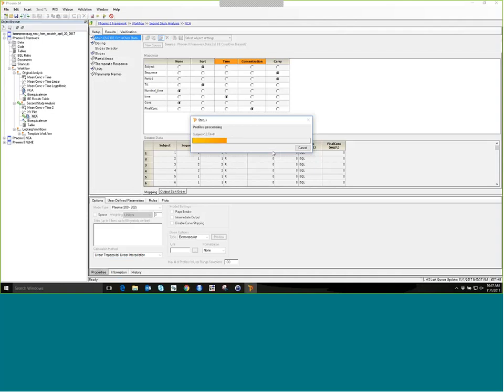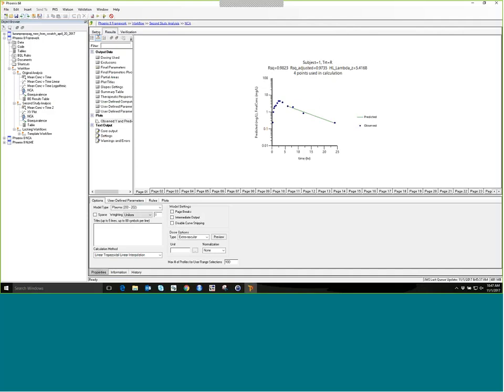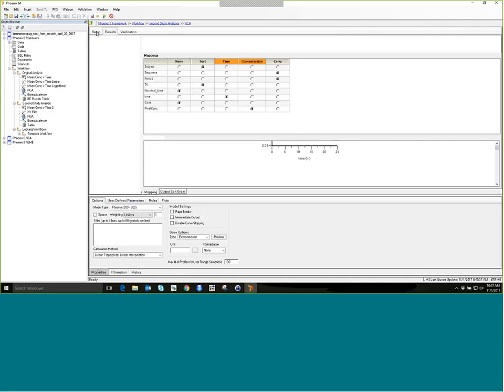So it's very, very easy to load up settings for any of these objects inside of Phoenix, and it applies to nearly every object. There's a couple, like the reporter, that it doesn't apply to. And you can see there are the results, but all the settings were exactly the same. It's going to do everything exactly the same way.